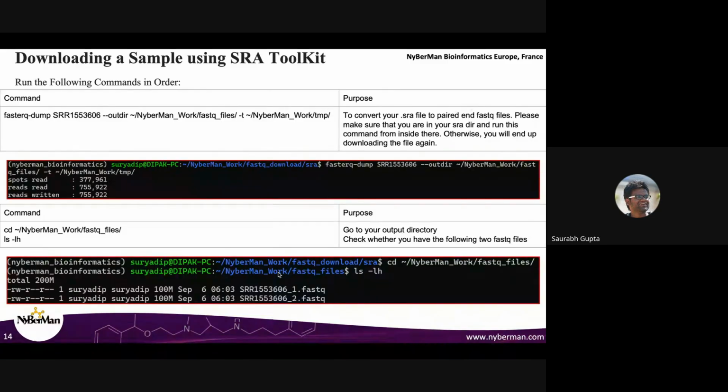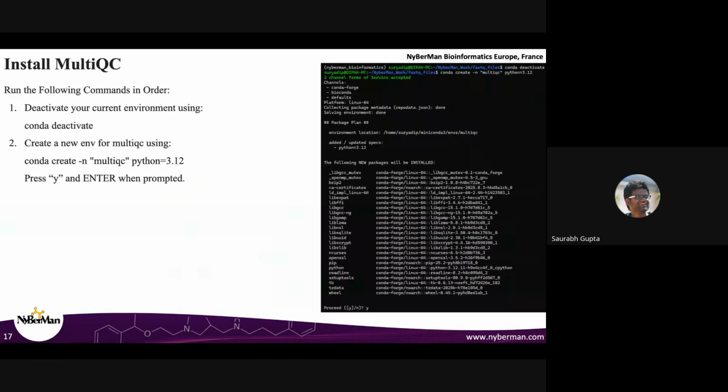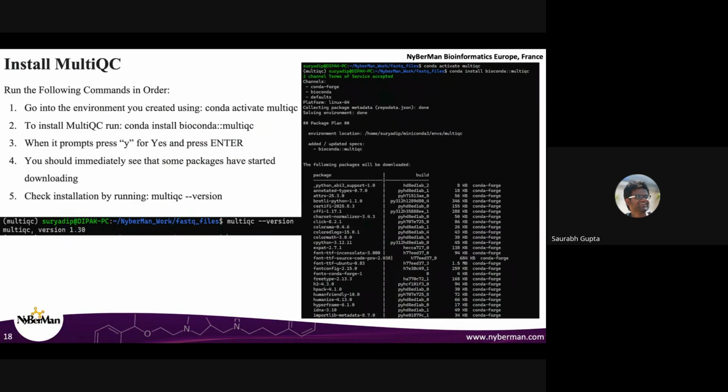Okay, so now what I will do is, because it's time already, maybe I'll stop now for today's session, but I'll give you guys a little bit of exercise. Now you guys are very comfortable, I reckon, with working through the file folder structures. You have the slides already, and you have the steps for FastQC, for example. You don't really have to worry about the installation. Installation is already done for FastQC and fastp, also for MultiQC.